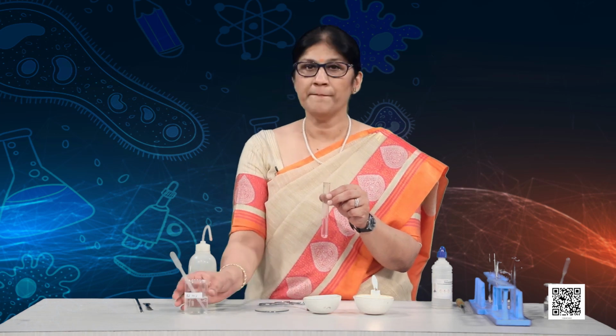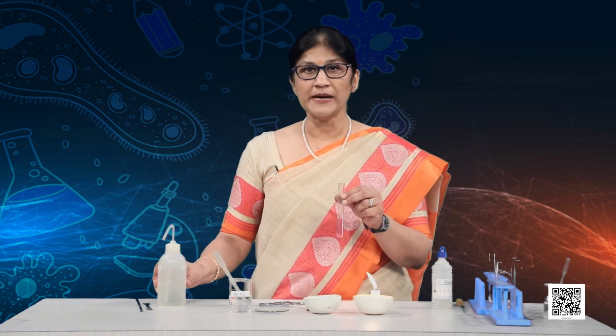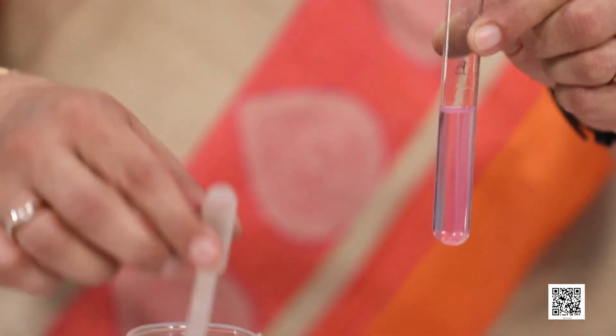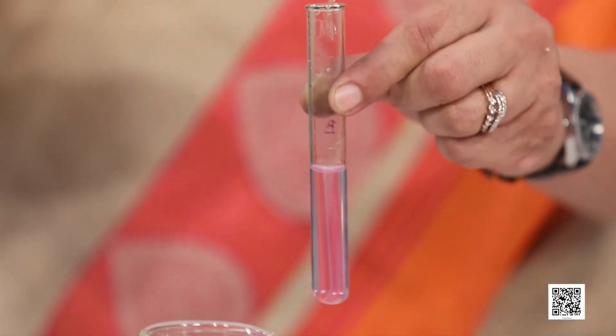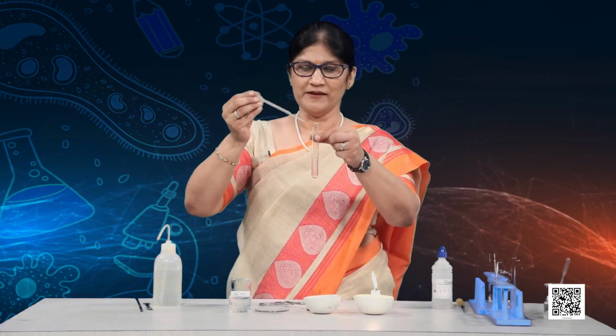So, we had dissolved magnesium oxide in water, which gives me magnesium hydroxide. This with phenolphthalein gave me pink color, and now let me add some dilute HCl to it to see how metallic oxides react with acids. By now you already know what is going to happen. It is no more a magic for you, I am sure, because when we put this acid, the color should disappear. Wow.